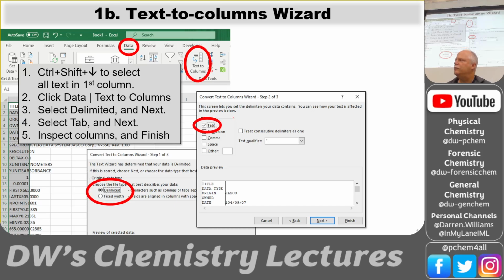What was the one y'all did this past week? Was it comma or tab? Do you remember? Yeah. It's not really important. But if it's comma separated values, then you would click comma here. Sometimes it's space separated values.